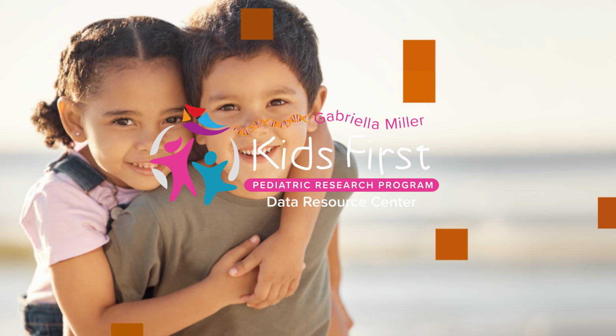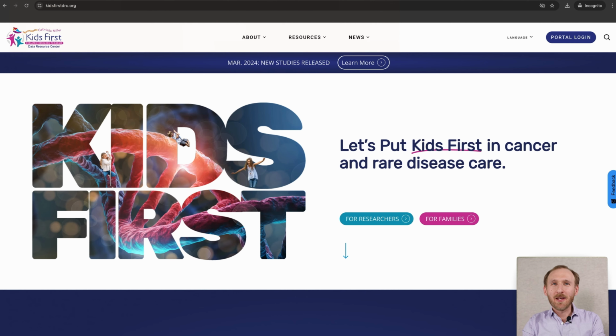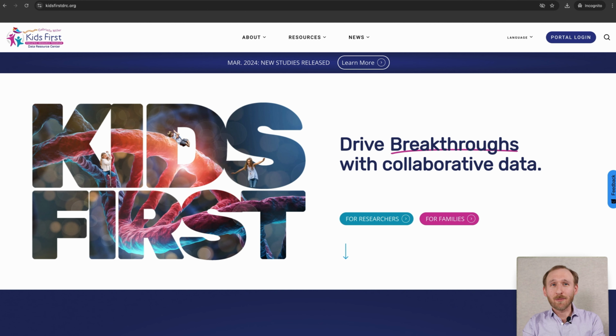CBTN genomic data is housed within the Kids First Data Resource Center. In this tutorial, we'll show you how to access and explore these resources. My name is David from the Gabriella Miller Kids First Data Resource Center, also known as the Kids First DRC. And in this video, we'll be exploring the Kids First Data Resource Portal and website.